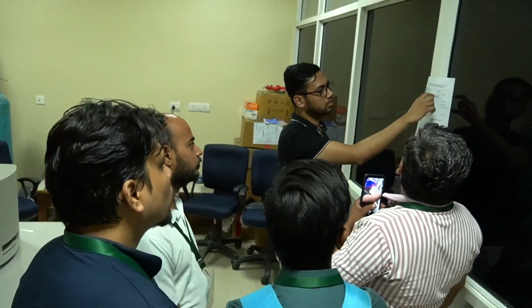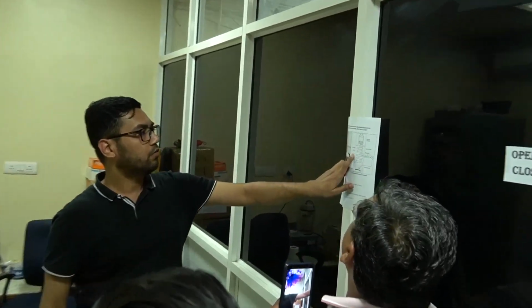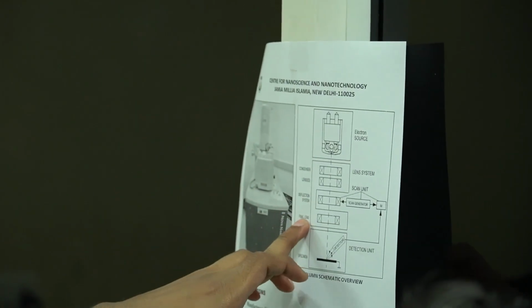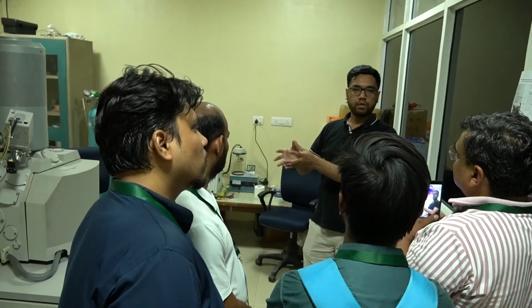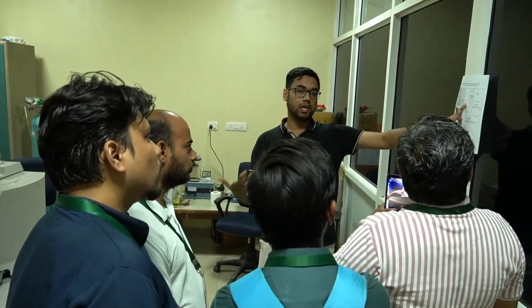The beam passes through this second section of this microscope. It is composed of different kinds of lenses: the condenser lenses, some deflection system, and final lenses. The final lens is called the objective lens. In an optical microscope, we have a photon light source and convex or concave lenses, whatever we call them. But here the lenses are a special kind.